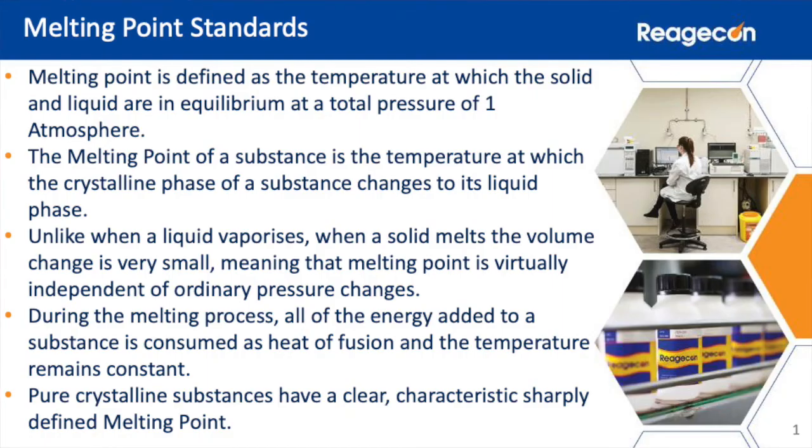The melting point of a substance is the temperature at which the crystalline phase of the substance changes to its liquid phase. Melting point is defined as the temperature at which the solid and liquid are in equilibrium at a total pressure of 1 atmosphere. Unlike the volume change that accompanies the vaporization of a liquid, the change in volume that takes place upon the melting of a solid is very small. Therefore, the melting point of a solid is virtually independent of any ordinary change in pressure.